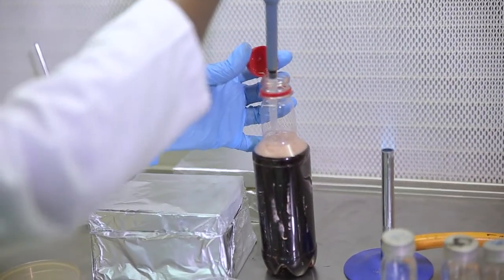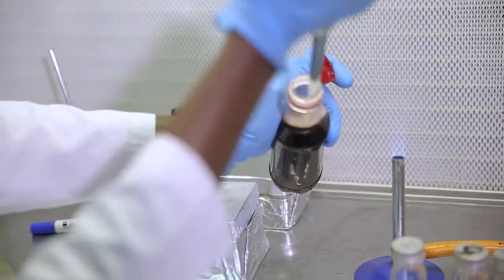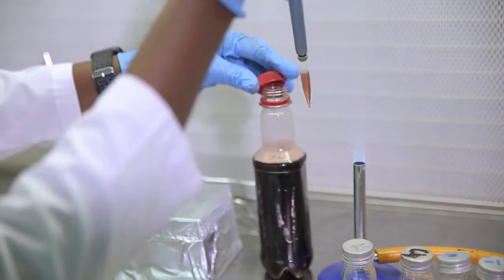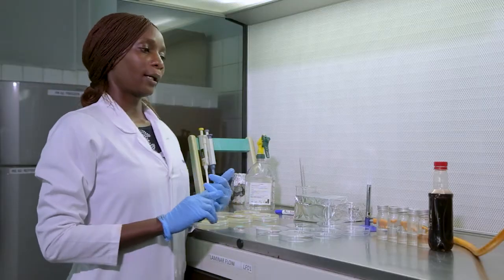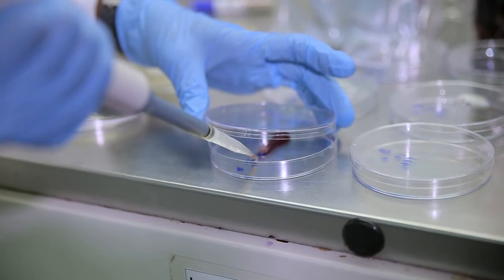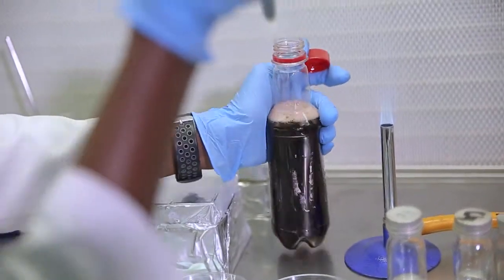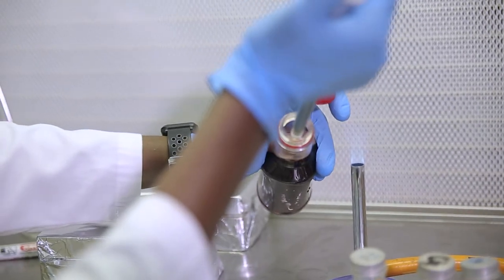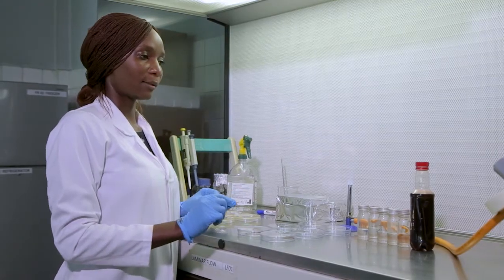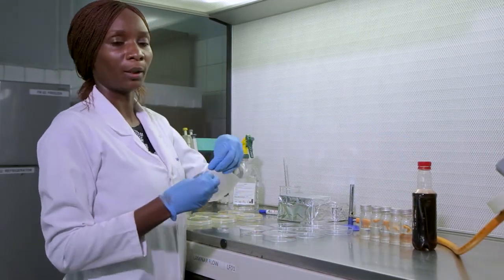So you notice that among the dilutions that I have plated, I have the diluted samples, but I've also chosen to plate the sample itself because I told you about the history of the sample. This particular sample was pasteurized. So it's important for me to include the sample itself among my dilutions, just in case the concentration of microorganisms in the original sample was too low.